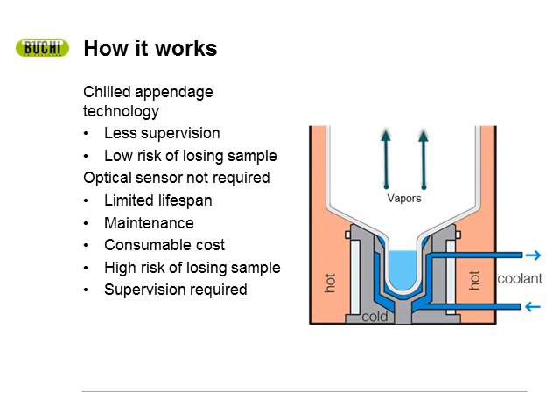Everything outside of this chilled zone is introduced to the platform, which is being heated, and everything else would be evaporated off. So if you're concentrating to a residual volume of 1 milliliter, it'll take you right to that chilled zone, and you really have a low chance of losing your sample.